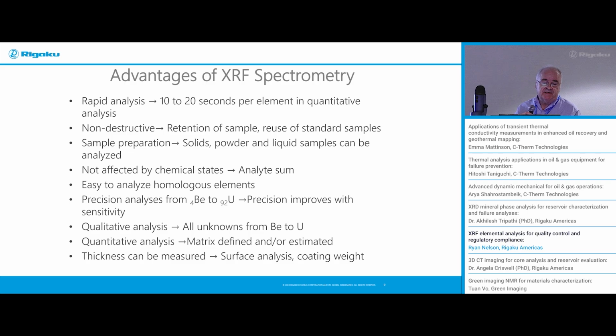And it's very precise. Beryllium, of course, lighter elements, there's more deviation, versus it's based on square root of count rates over counts. And qualitative analysis using a theoretical library lookup. So that's very good typically to ICP referee methods. And quantitative, of course, is based on empirical setup and FP setup.